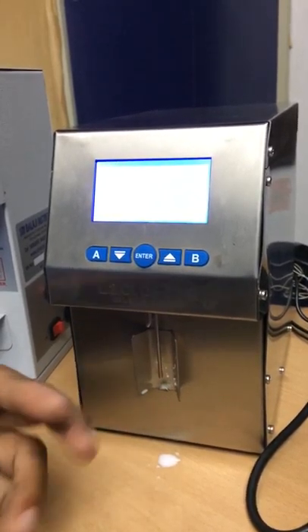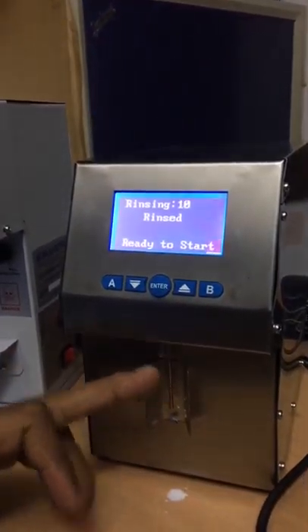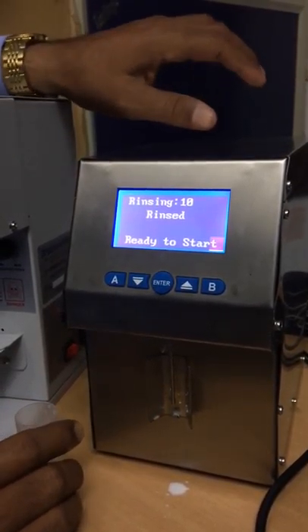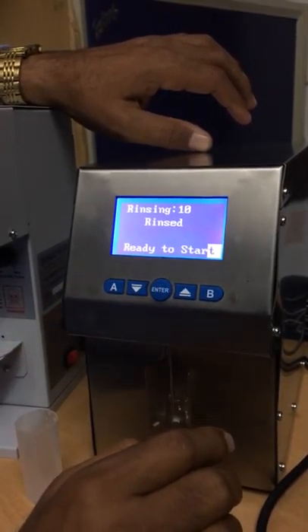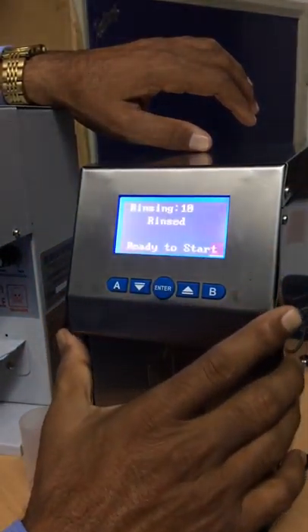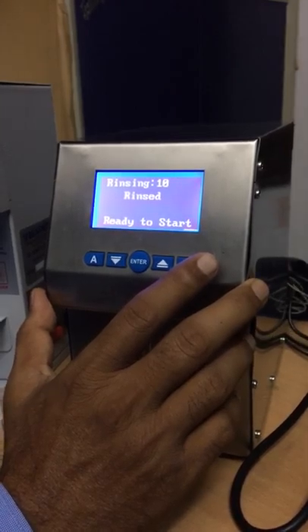You can put solution for 5 cycles and water for 5 cycles, then the cleaning is over. If you want to measure, simply press Enter and it goes to measuring mode. There is also a system setup. Here I will show you the system setup options.